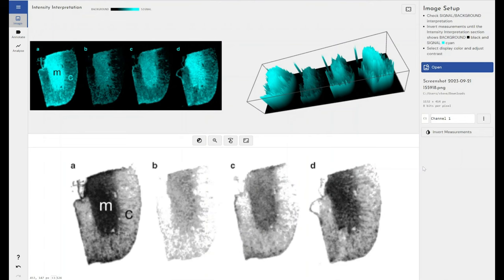I'm looking at a phosphor image here. You may know it as phosphor imaging or you may have heard of it as autoradiography, where essentially a radio-labelled ligand binds to a sample and produces an image. Phosphor imaging or autoradiography can be used to image things like bands on a gel — for DNA and RNA analysis, western blotting and things like that. Largely that's been replaced by chemiluminescence, but it is still out there.